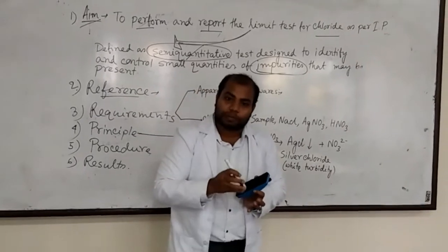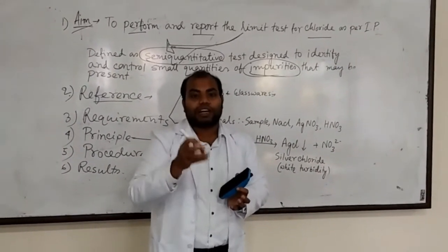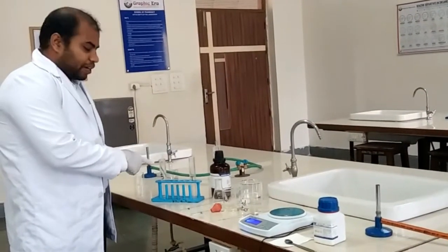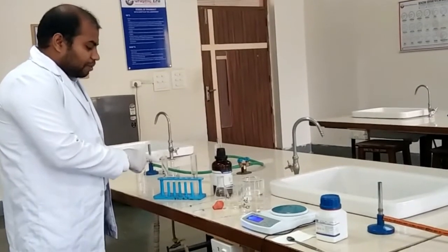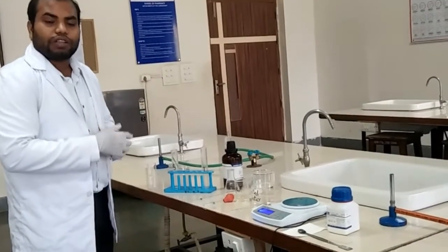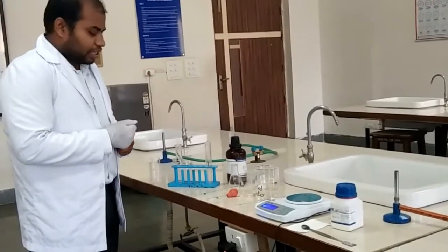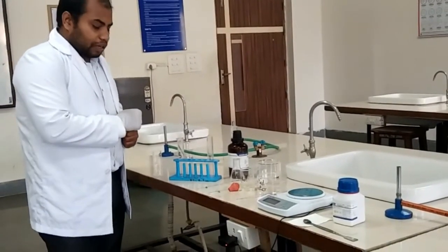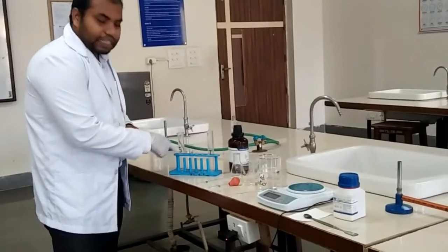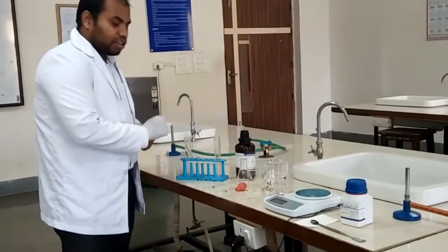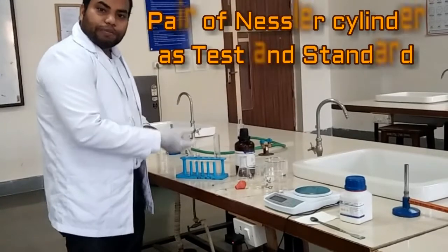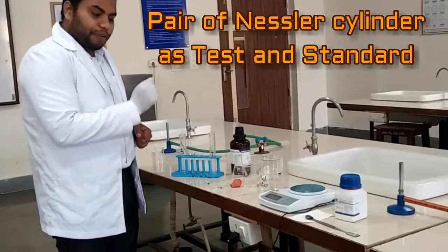Let's go to the working slab where we are going to perform the laboratory work. This apparatus used for the limit test of insoluble ions like chloride and sulfate is known as a Nessler cylinder. We have marked the cylinders as S and T — for standard and test — and we will perform the respective procedures in each.